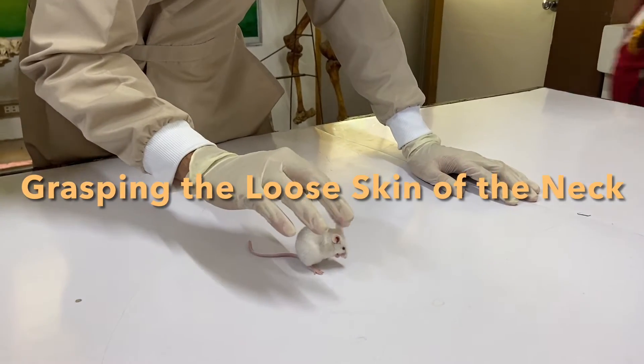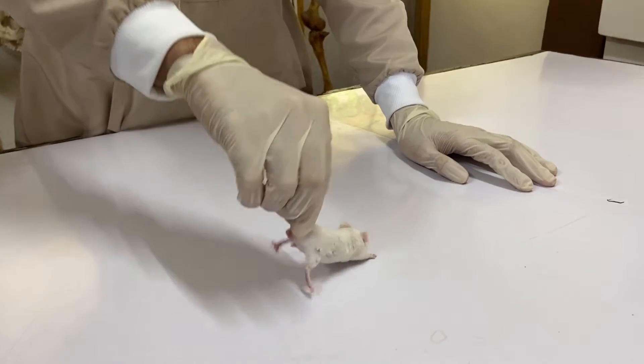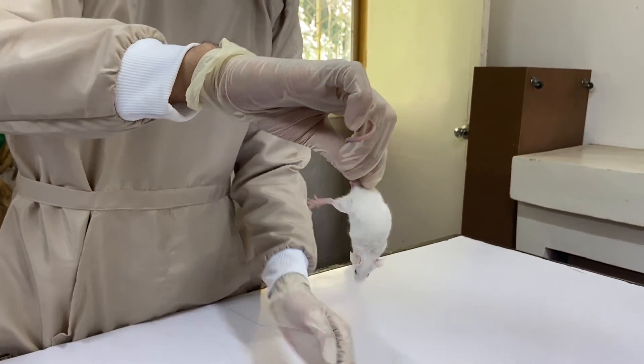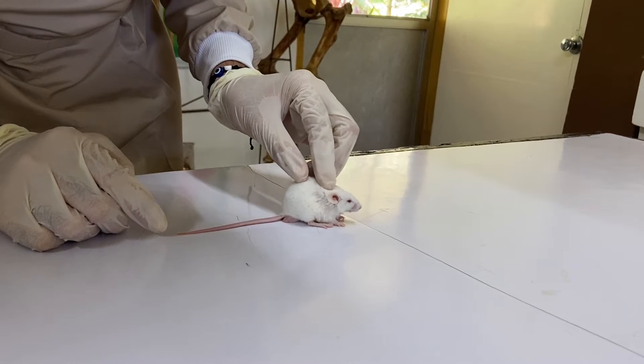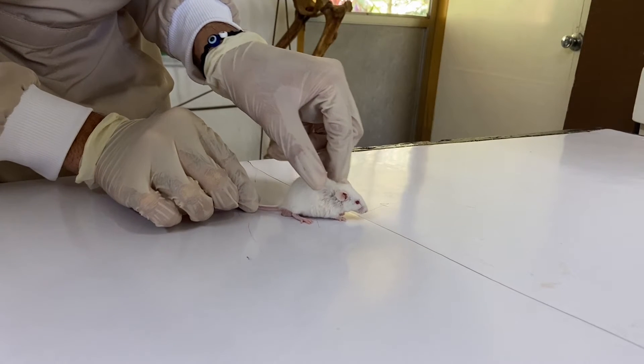Grasping the loose skin of the neck. Step 1: carefully but firmly grip the base of the tail with the dominant hand. Lift the mouse onto the cage top or onto a rough surface. Gently pull the tail backward as the animal tends to move forward and hold onto the grid with its fore legs.